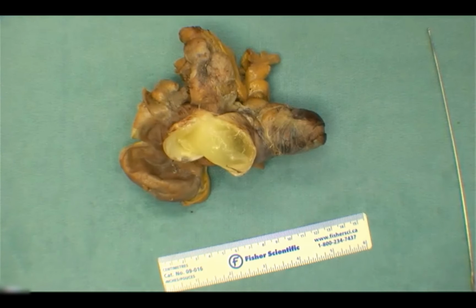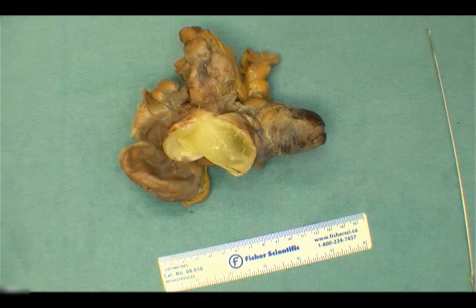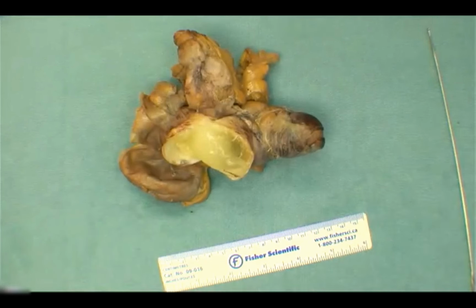Then from there, just representative sections of the cecum, again, of those submucosal lipomas. Take a look through to see if there's any lymph nodes in some of the fat here. And that's really about it. Use photography to your advantage. I think this particular specimen lends itself really well to having photography support and complement the gross description. But I think the old saying goes, a picture is worth 1,000 words. And I think this is one that would really benefit from a picture.